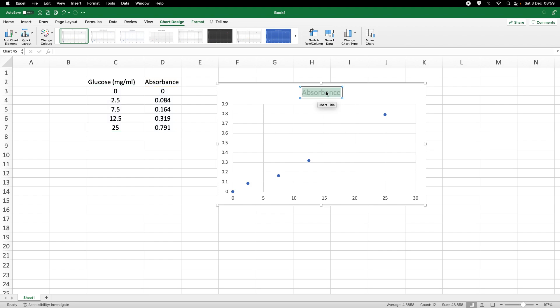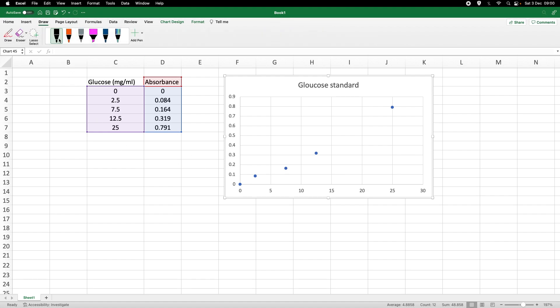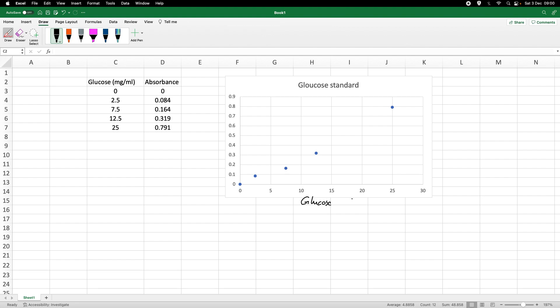I give it a nice title: glucose oxidase glucose standard. For the x-axis I write glucose concentration in milligrams per milliliter, and for the y-axis we have absorbance, which of course has no unit.